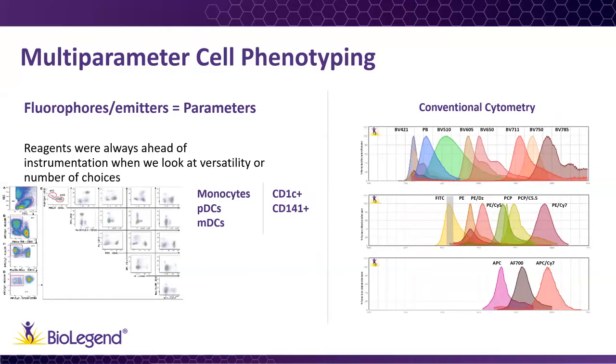Now, we all know that complex biological questions require more and more information to provide accurate answers. The need for higher resolution in dissecting overlapping cell populations, or even discovery of new cell types, has been driving the evolution of both more capable instruments and new dyes or fluorophores.